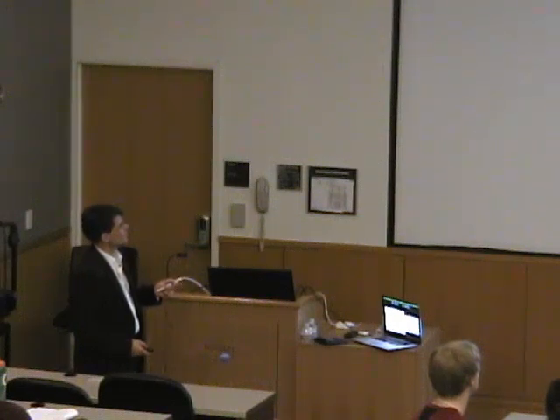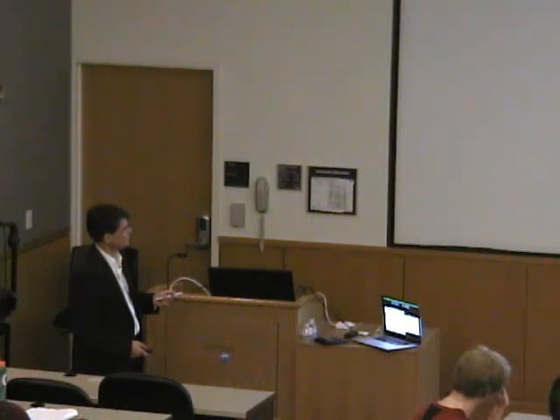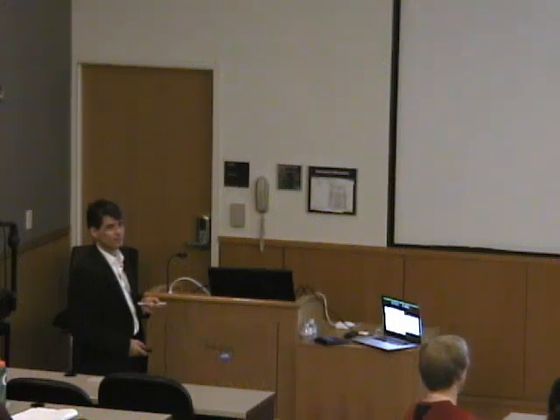And you can go from the ground state to the singlet P1 excited state with an LCP photon. Now the way I've drawn this, you see that these two transitions have different energy, right? So that means it's totally drawn out of proportion. This is tens of thousands of wave numbers, and this is like a wave number or two. That means in terms of absorption, the LCP absorption and the RCP absorption are slightly shifted from each other, and since the MCD sees the difference of these two, you end up with a derivative shaped MCD signal.